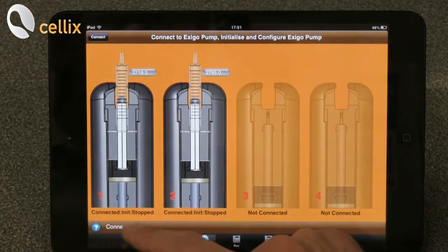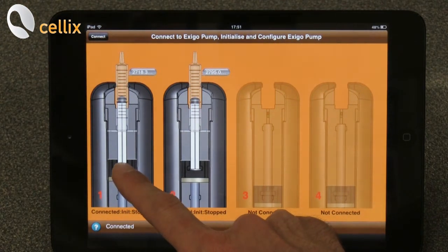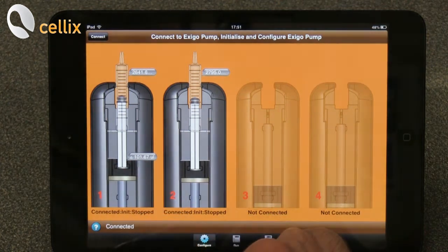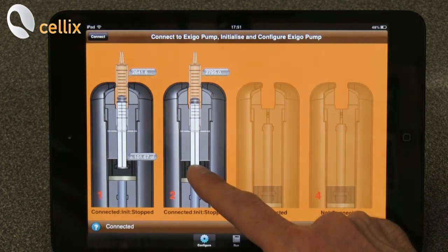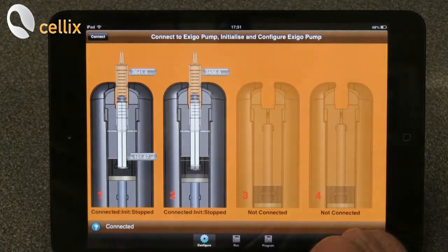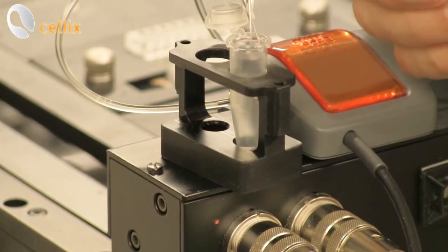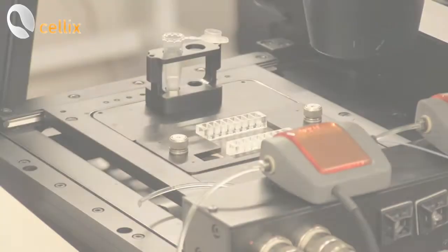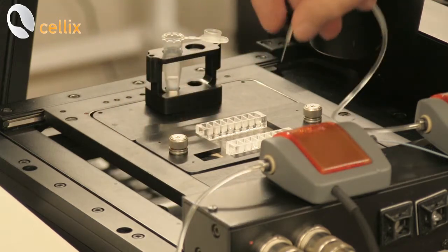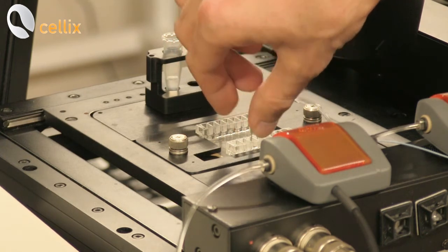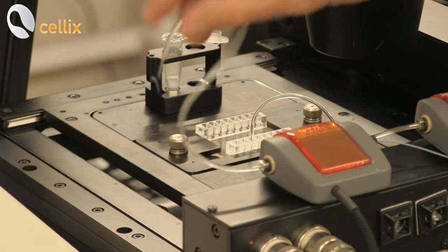In order to do this you just need to move the plunger guide of a small amount. I will show you the volume which will be dispensed. And the same can be done with the second pump. You can see here. We can plug now the tubing into the chip. So simply do this. And we do the same thing for the second pump.